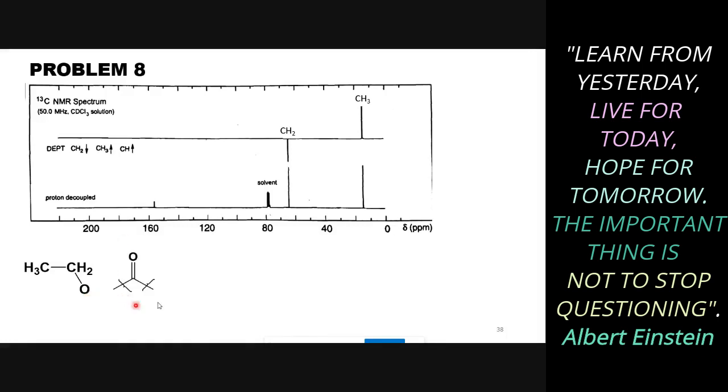Then we also saw a carbonyl in the IR spectrum. So now we have three carbons, one, two, three. We have five hydrogens and two oxygens. But we don't have any other signal in the proton NMR spectrum or in the carbon-13 NMR spectrum. We are done with the spectra, but we are deficient of two carbons, one oxygen and five hydrogens.